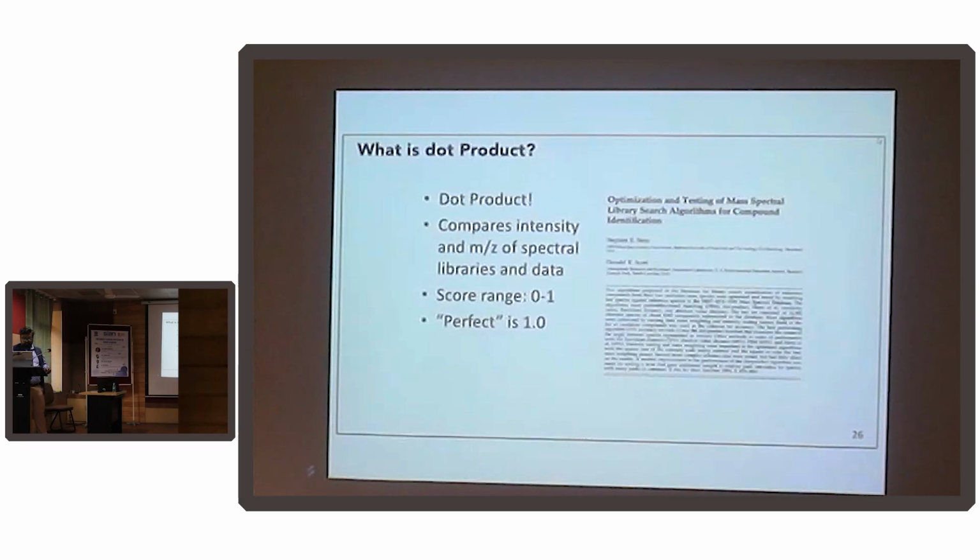And one more thing you need to think of: since you already have computational data coming from the Skyline database, Skyline will predict what its retention time could be, what data you would achieve. Then there is experimental data, which of course will be different.